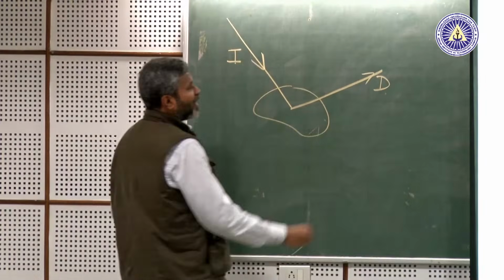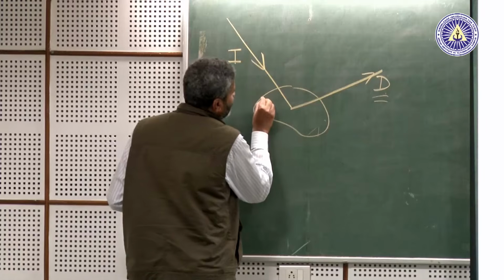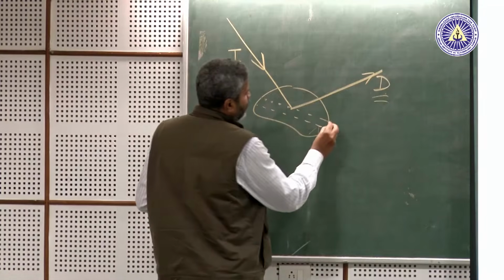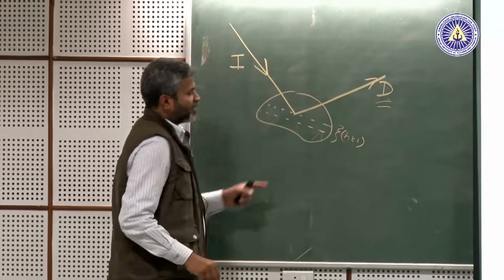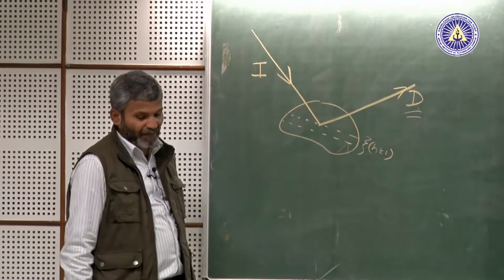And we want to name that diffracted beam. Bragg showed that you can find a plane from which it appears to be reflected. So, name it according to the plane from which it is reflected. So, I will say this diffracted beam is the HKL beam, meaning it is reflected from the HKL plane.